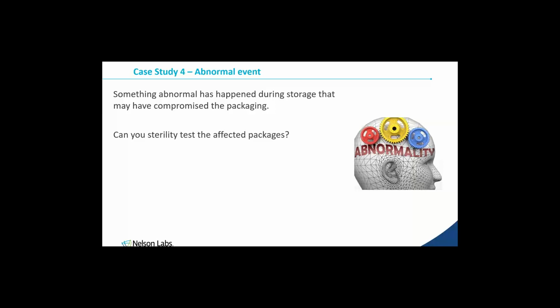So I might have sterility, but that might not be what would be considered a clean product. I have some form of contaminant somewhere. But let's say also, and this gets to you, Jen, in the packaging, what happens if it's summertime and my package sits on an aircraft for an extended period of time, or on a dock at the airport, or it's wintertime right now? What happens if it sits in the cold and I'm not able to ship it due to flight delays or things of that nature? What do I do with those anomalies?